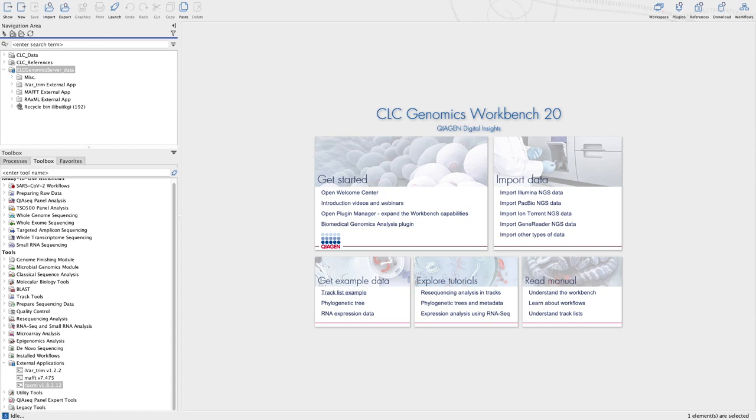Okay, welcome everyone. My name is Kevin Libwit, and this is the final video of our three-part tutorial series on external applications for the CLC Genomics Server platform. And in this video, we'll be using the same three-step approach that we detailed in the first few videos to write a third external application, this time for RAxML, a maximum likelihood tree builder written by Alexandros Stamatakis from the Heidelberg Institute for Theoretical Studies.